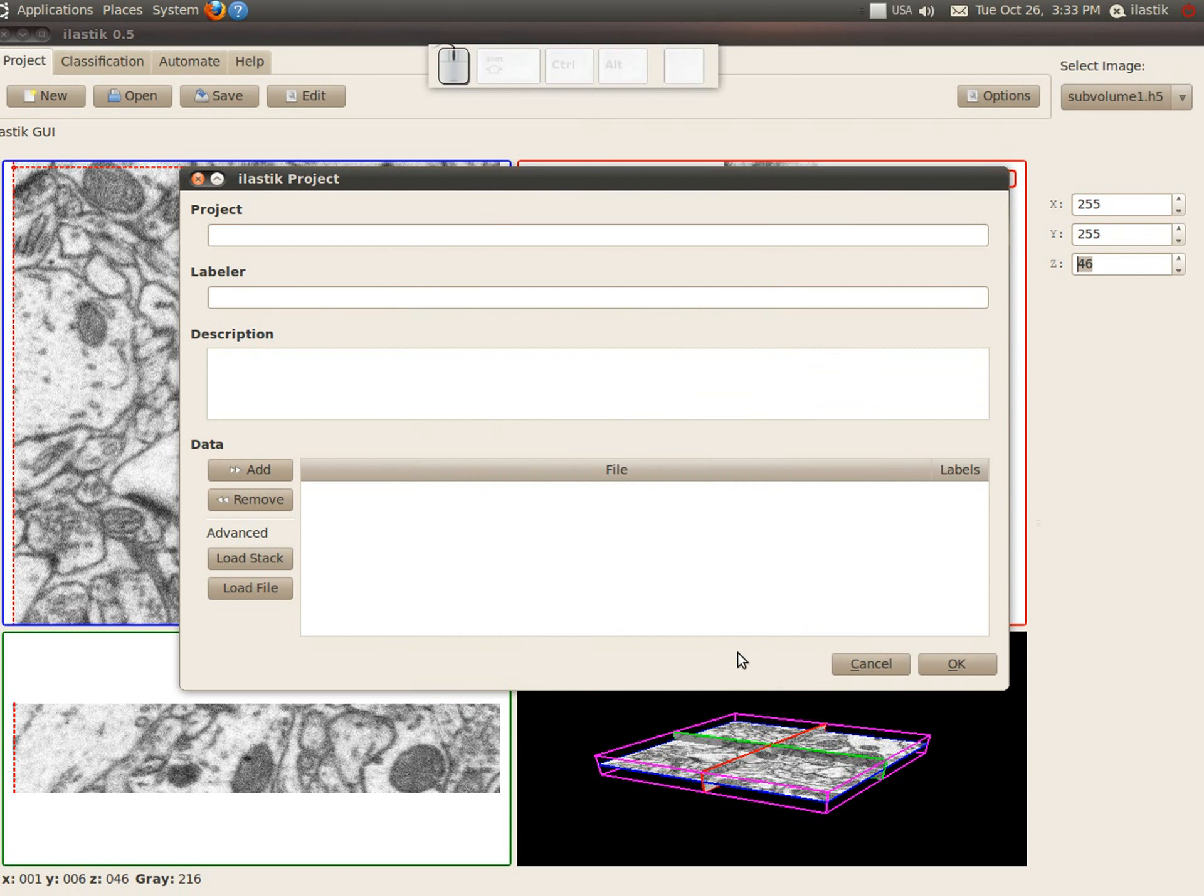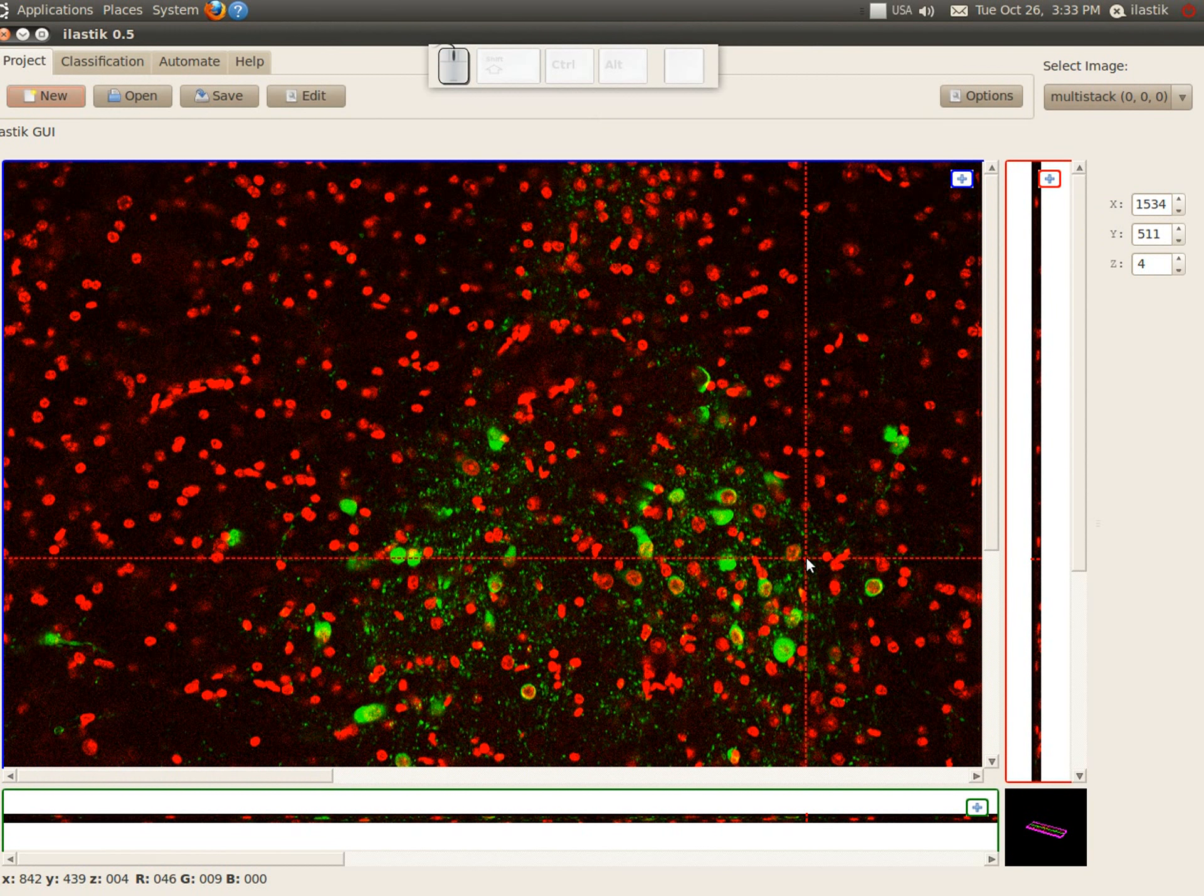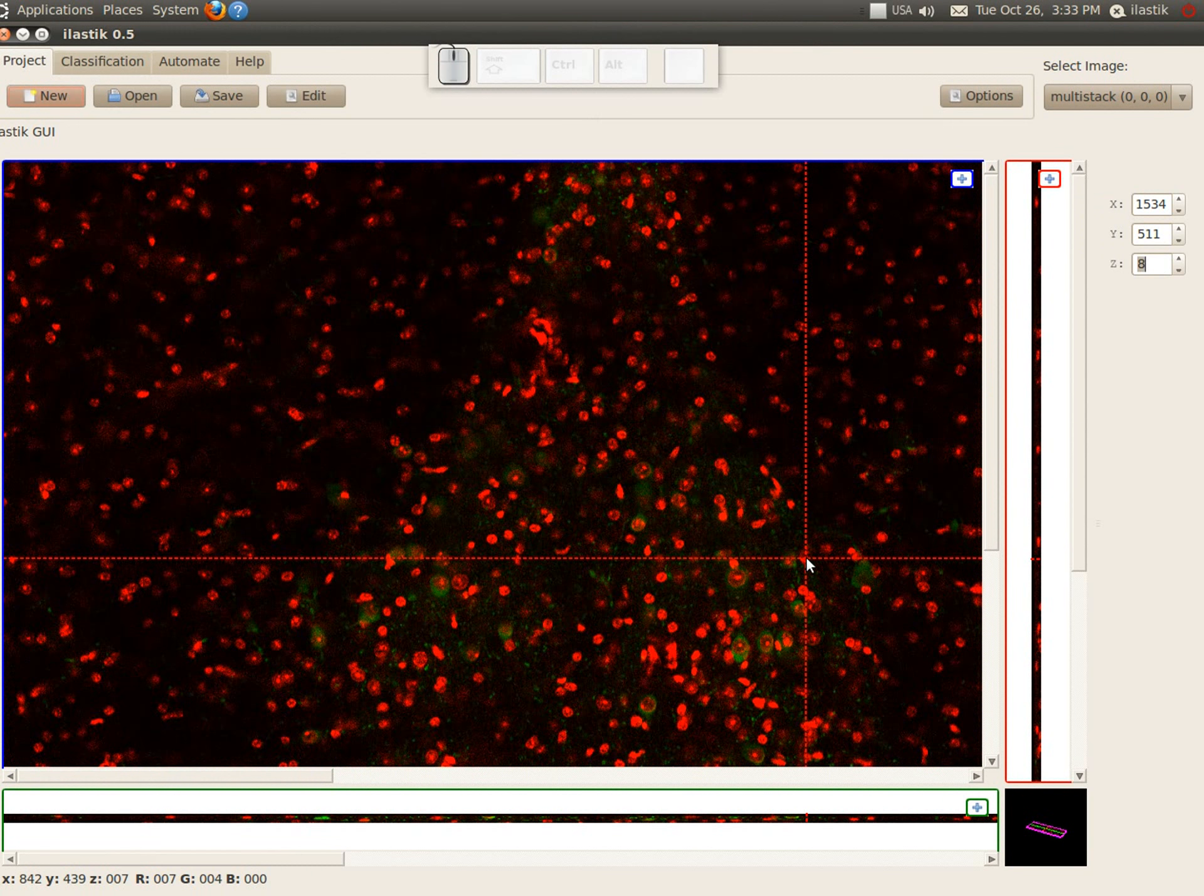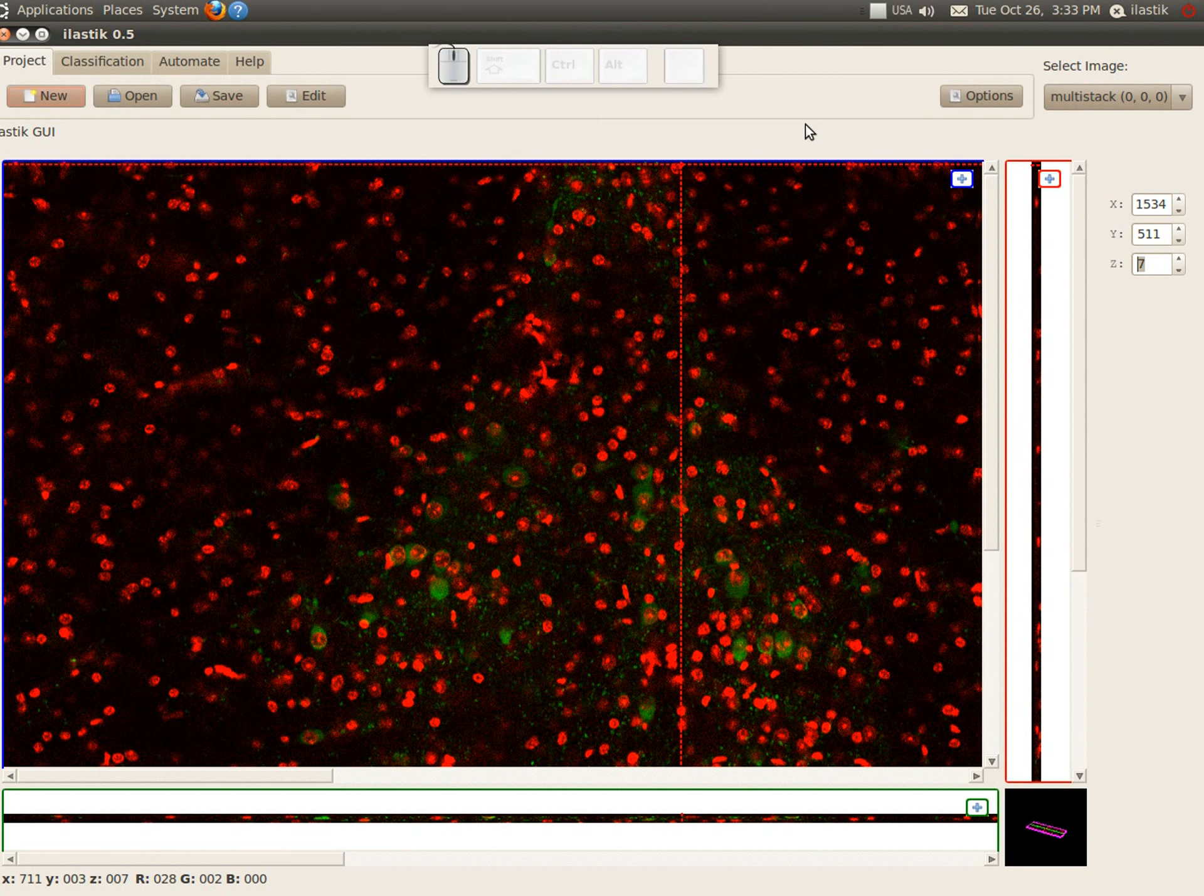And now we can load a stack and we see that it correctly loaded them in different colors. Well, that would be it for today. Enjoy using Elastic!